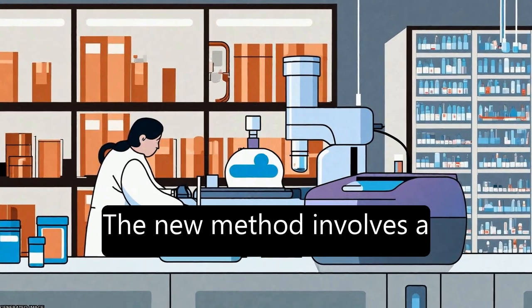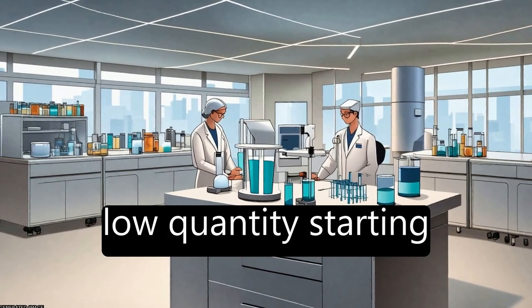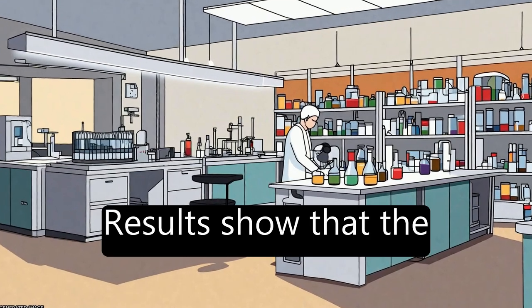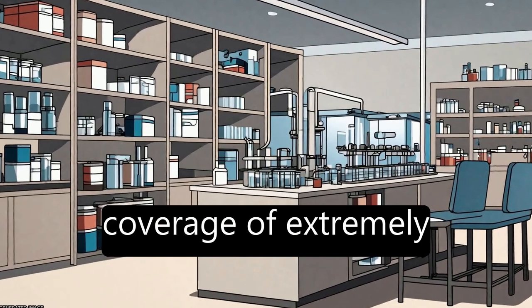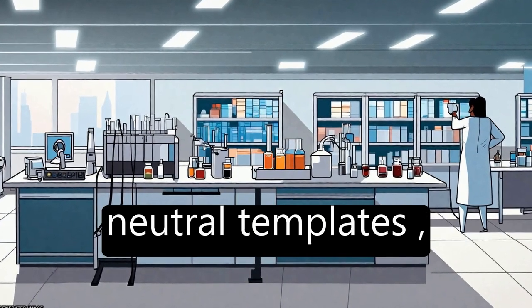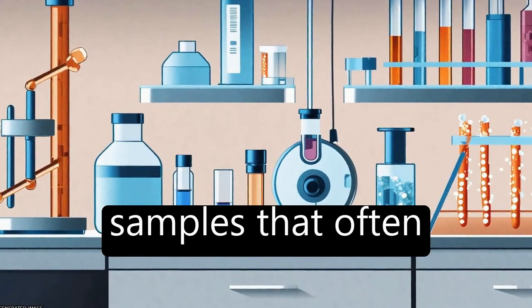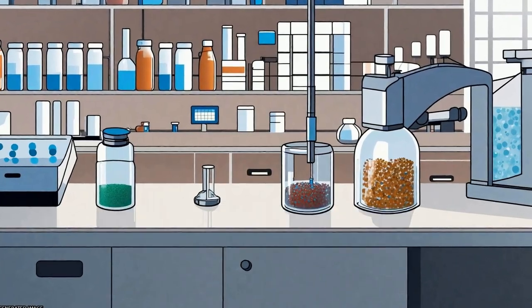The new method involves a PCR additive, TMAC, and has been optimized for low-quantity starting material and tolerant to extremely high AT content sequences. Results show that the optimized conditions produce amplified libraries with improved coverage of extremely AT-rich regions and reduced bias toward GC-neutral templates, compared to standard methods. The new method will greatly benefit sequencing clinical samples that often require amplification due to low mass of DNA starting material.